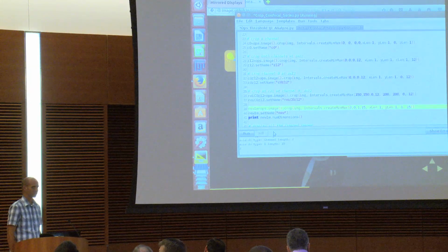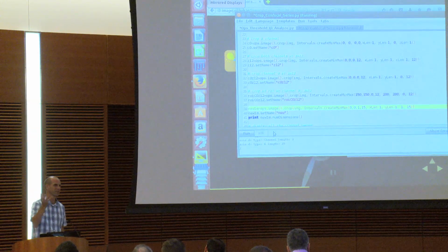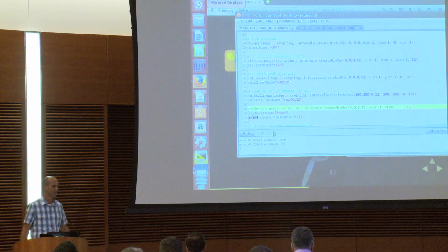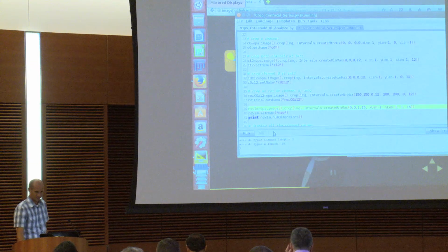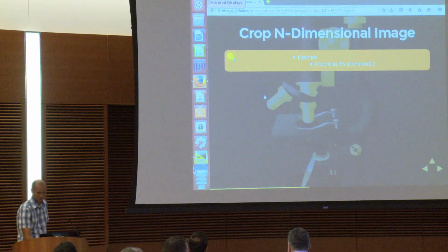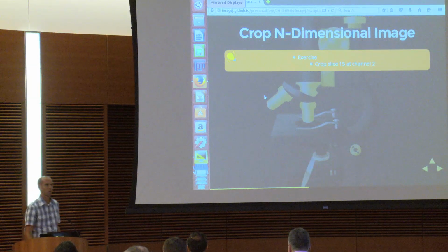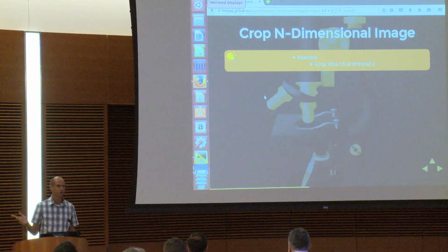But yeah, I can update this example. I was actually working on it just because of a question that was asked, and I can update it to show an XYC or something like that. Okay, so that was the first example. Any other questions about that example?